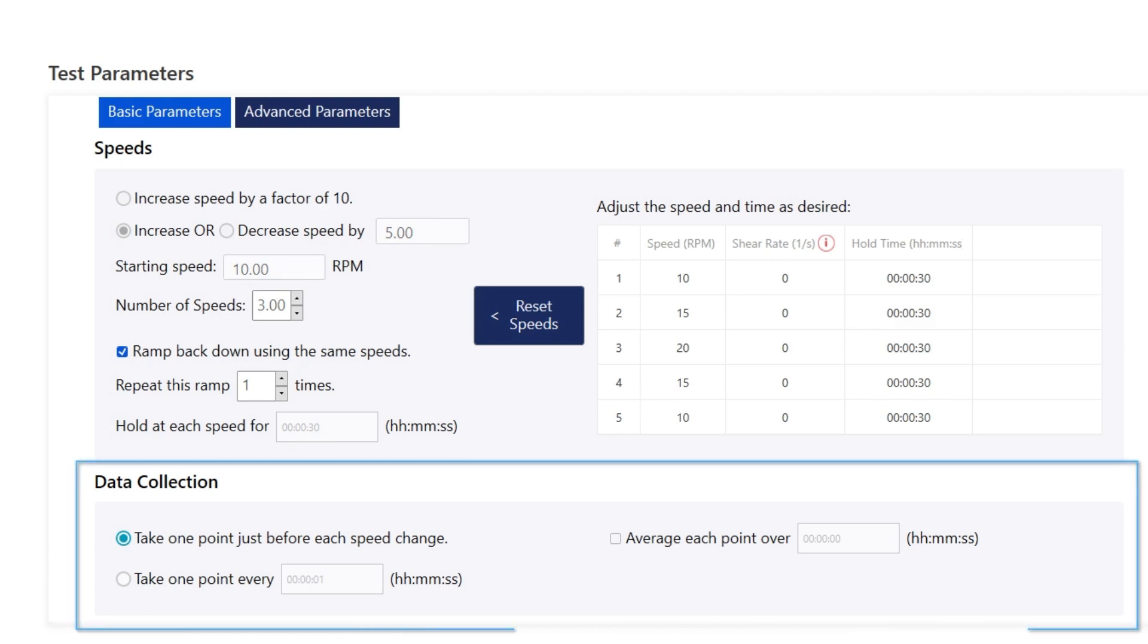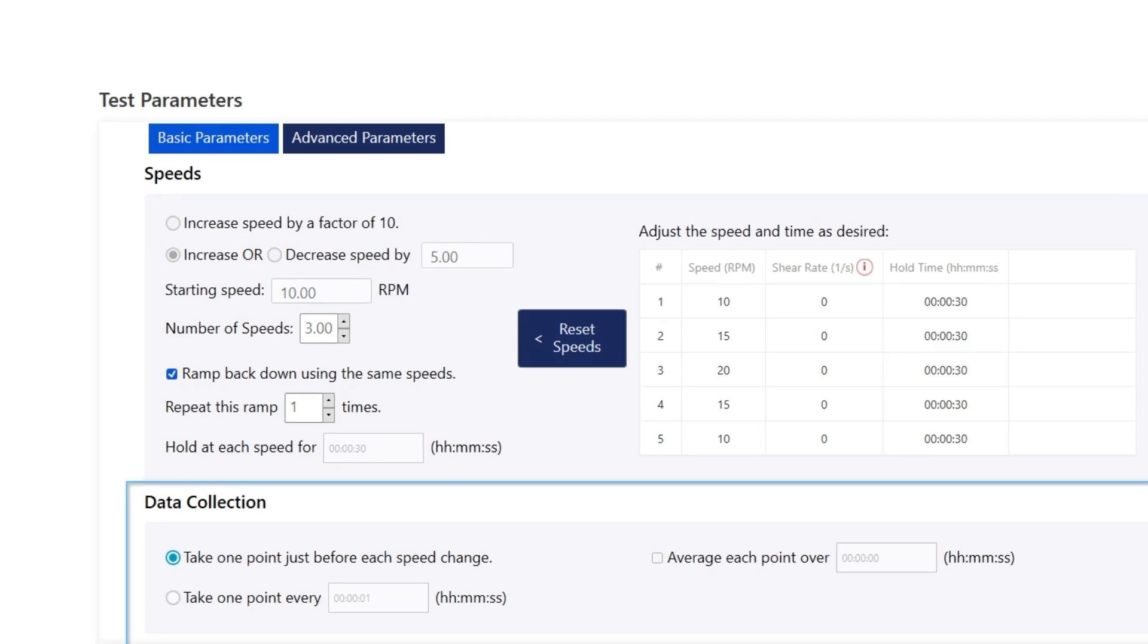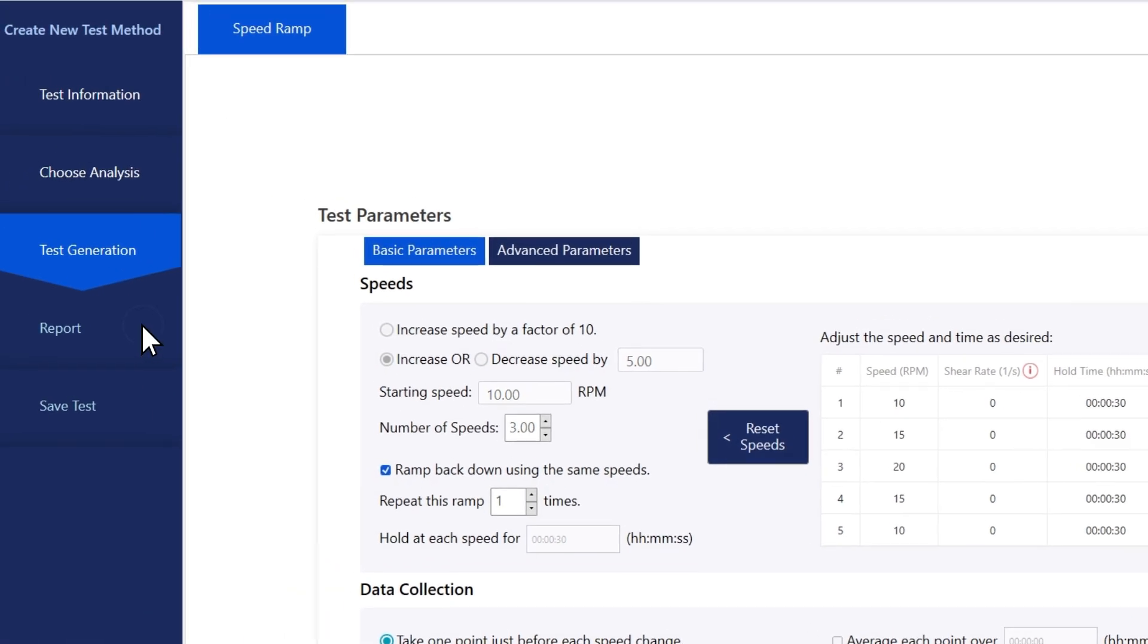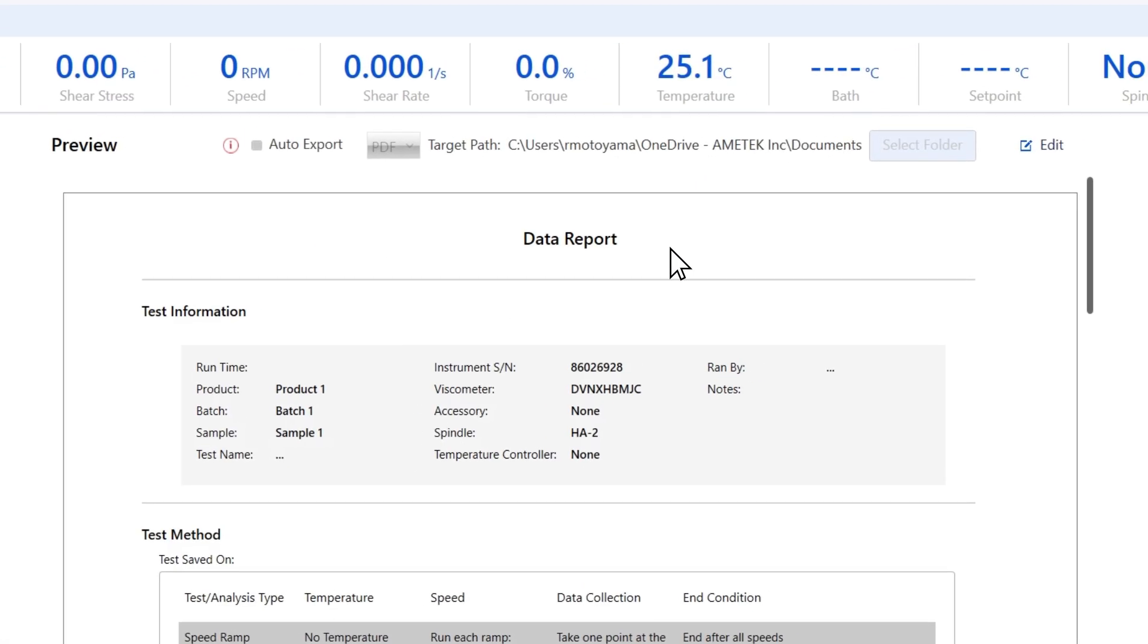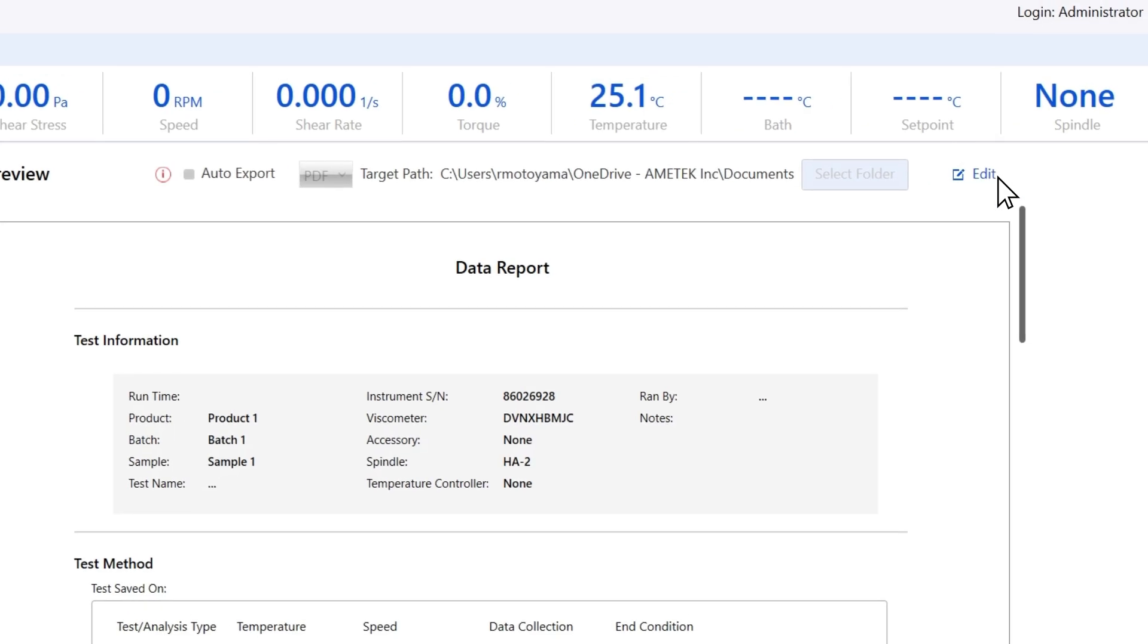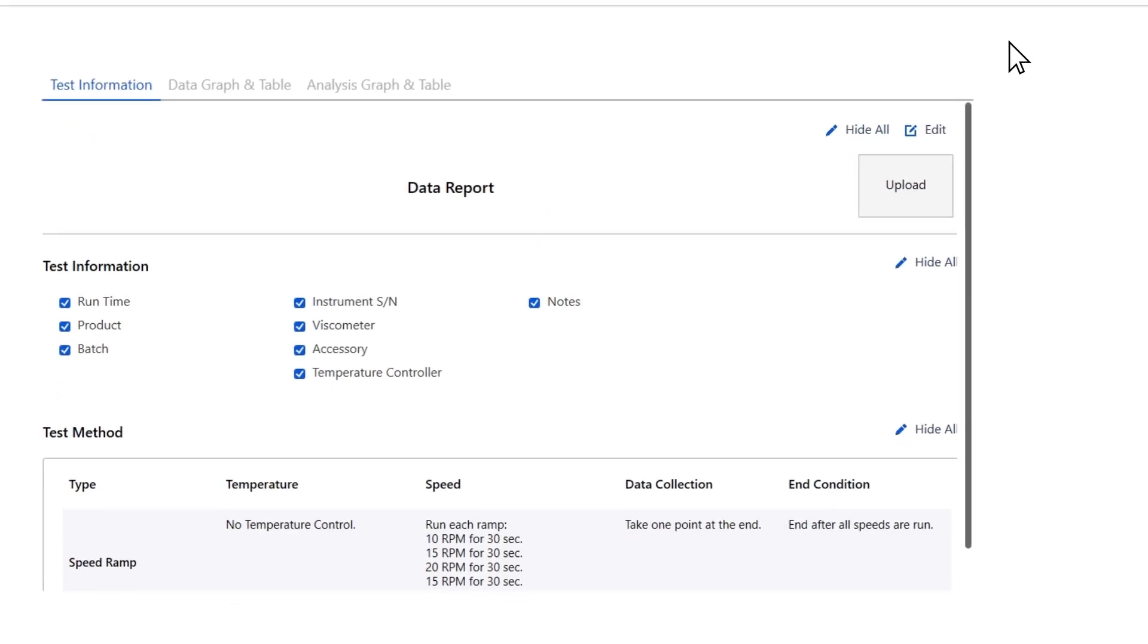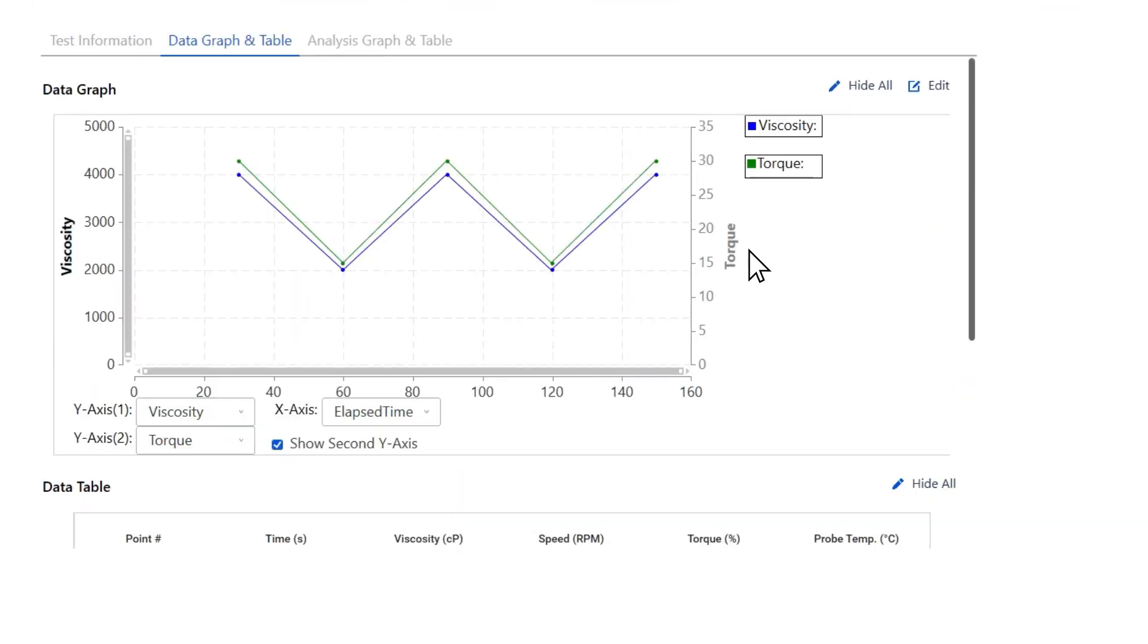For the data collection, we'll keep it at the default.